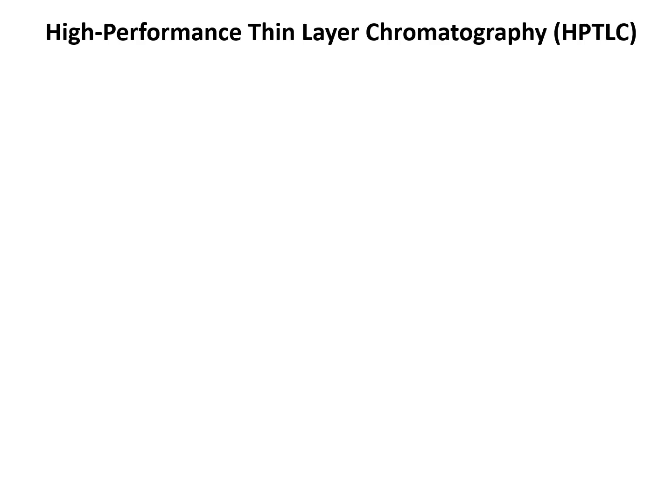High performance thin layer chromatography is an advanced form of thin layer chromatography that provides an enhanced separation, high sensitivity, higher resolution, higher reproducibility, and quantitative capabilities, as well as speed in analysis of compounds.